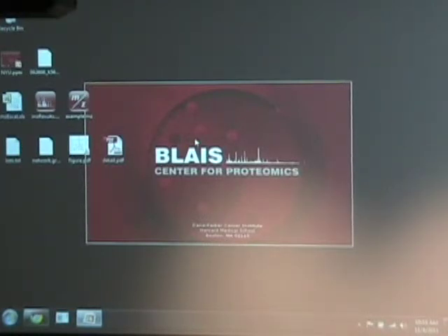PRIDE is another very good resource out there that's trying to come up with ways to look at the data. They have an interactive Java-based viewer. I'm waiting, especially, on the capability to make extracted ion chromatograms for people doing label-free quantitation. So we're now in the nitty-gritty, but it is starting to happen.